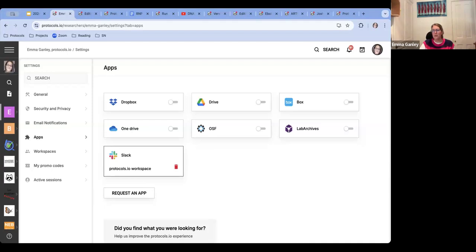You're kind of saying people use the same template but use different parameters, thus each protocol is different. I'm still not really sure exactly what you mean, but if a new user makes a copy or a fork of someone else's, they can make whatever changes they want. They can update the author list and adapt, but because anything made publicly available is under a CC BY license, essentially it's available for reuse with attribution, and because the fork is captured, that attribution is built in to any variant protocol that's created from a previous one.